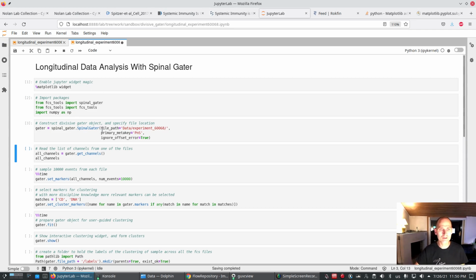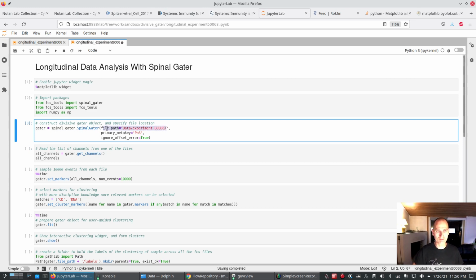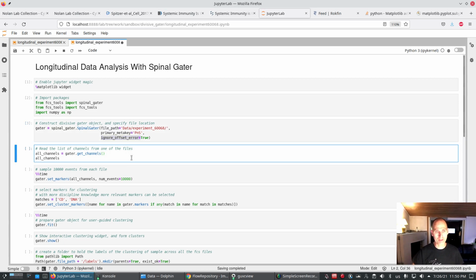For that, I need to specify the path to the FCS files I want to study, and I might need to specify which channel names I want to use. And for some strange reason, the FCS files I have downloaded don't quite conform to standards, so I need to ignore some errors in them.